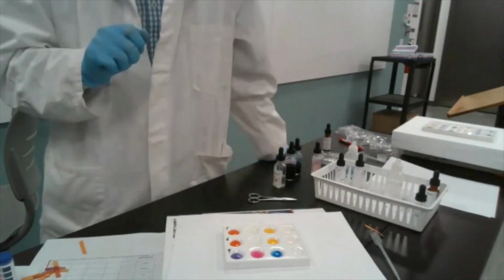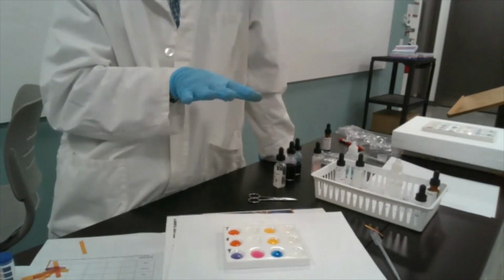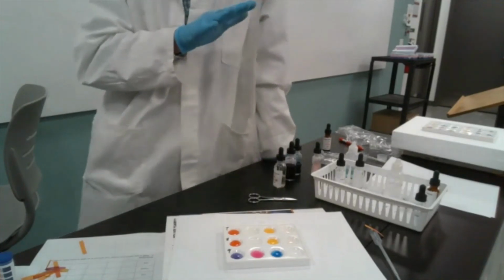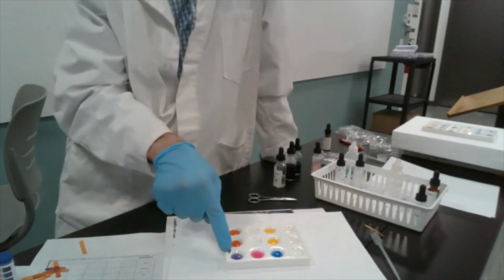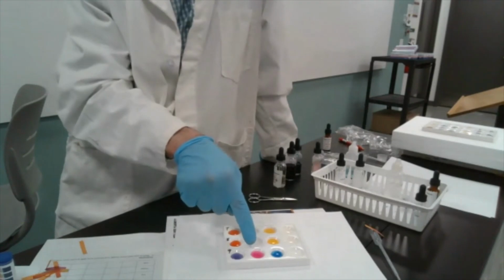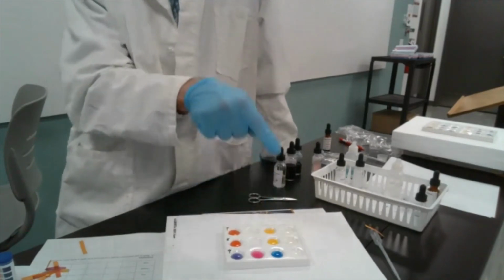Now, this was unexpected even to me because you see, I'm used to seeing very light pink in milk, but considering that milk is a natural substance, its chemical constitution might change, depending on where it came from and how long it was stored and so on. So what we're seeing is a blue with blue litmus. I keep confusing these two guys. Pink or light pink with phenolphthalein, and blue with bromothymol blue.